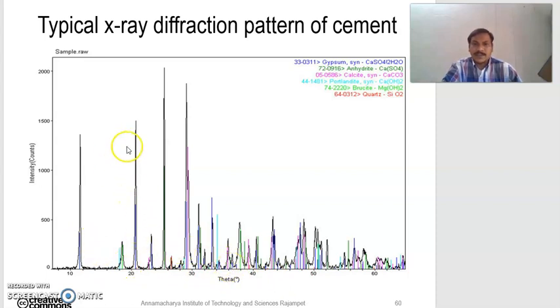The orientations of crystal planes are determined by using the Miller indices h, k, l. For example, there are a number of Miller indices or crystal orientations in the given material, like 110 orientation, 100 orientation, 111 orientation, like that. A number of orientations are available.